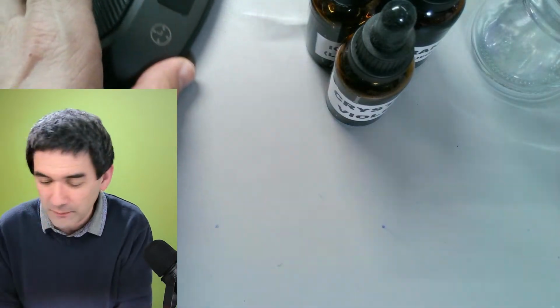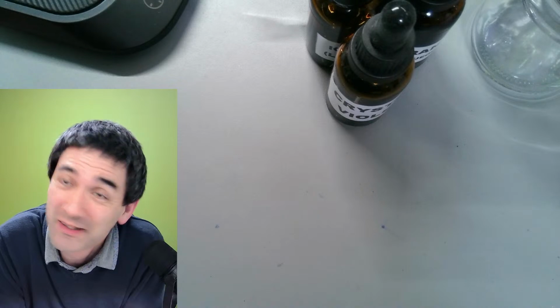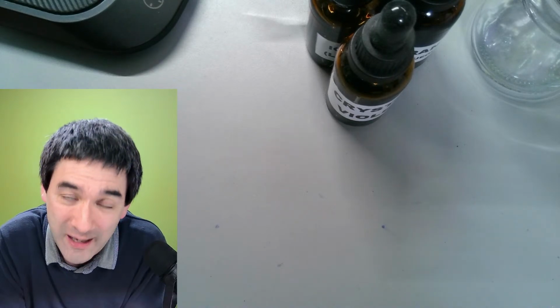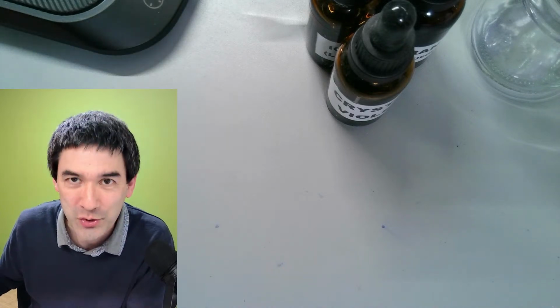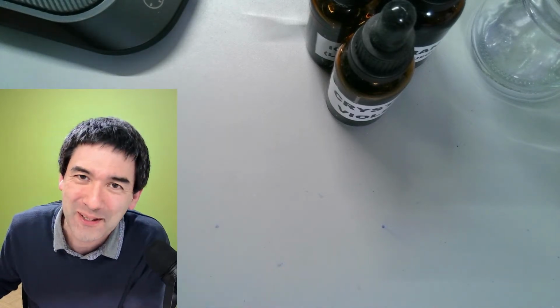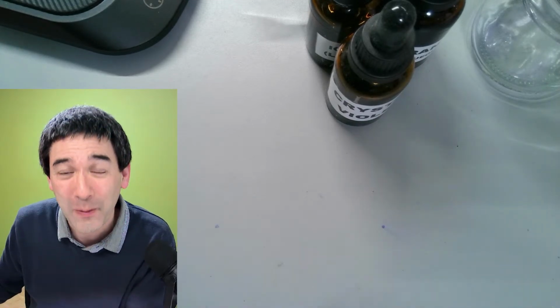And now I'm going to show you some of the Petri dishes that I have. Honestly, I nearly decided not to do this live stream today on this topic because those Petri dishes are an embarrassment. So, just a big disclaimer. I say an embarrassment because I'm a trained microbiologist, but the Petri dishes are pretty much the worst ones ever. I will explain why. At home I don't have a full laboratory setup, so I try to improvise.